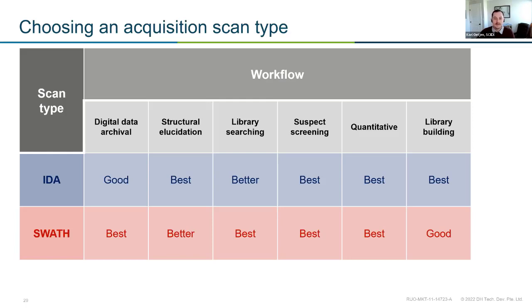And then a few years later, there was a master's student who had a different question, and she was really interested in kind of investigating the hydrocarbon surfactants present in those samples. So instead of having to go find those samples, dig them out, re-inject them, we just used the same exact data files, and she processed them and answered her question, which was unrelated to the question we were originally trying to answer. So being able to archive those samples digitally was really valuable.